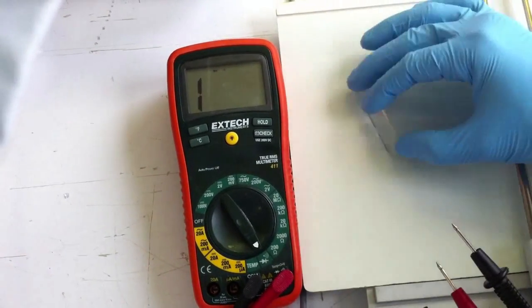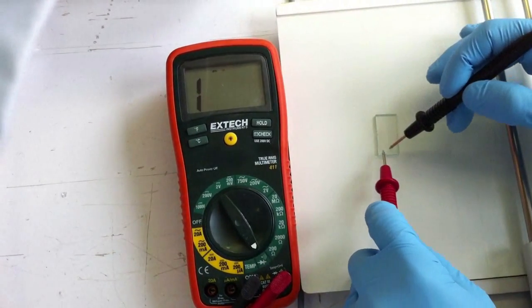The back side is insulating, while the working side is conductive, as indicated by the multimeter.